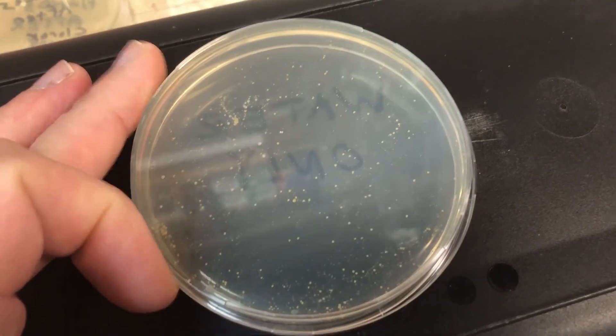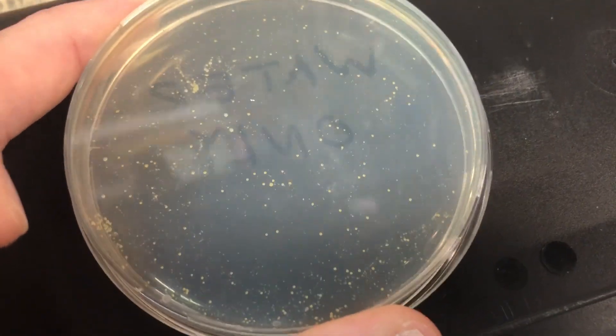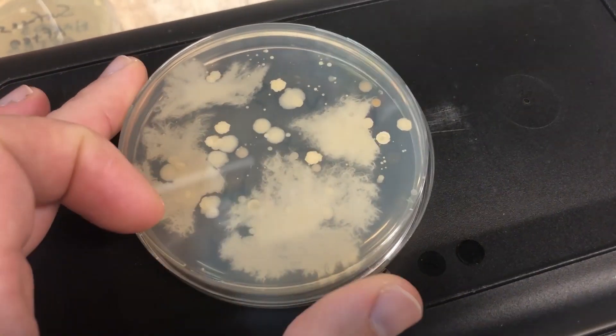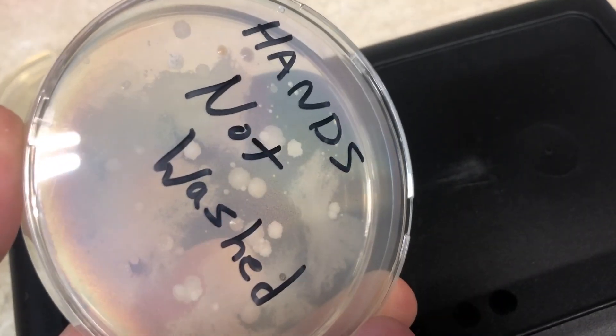The first dish is the water-only control, where I dribbled tap water directly onto the dish. You can see there is definitely some bacteria in the water — not a lot compared to the other petri dishes, but it's there. Next up is the petri dish where I touched my fingers without washing my hands. Check that out — there's a lot growing on there.